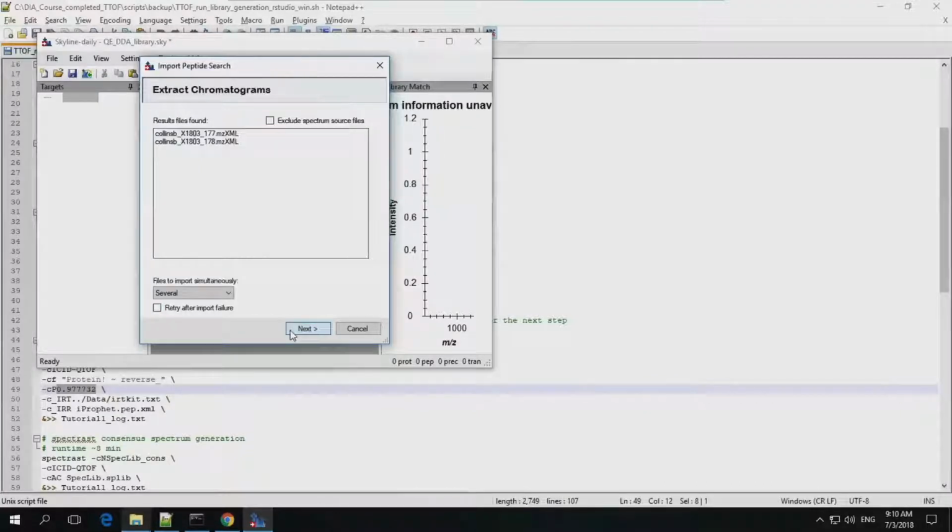So, and that helped me. I showed you that case with the rocket fins, where the rocket looks like it's taking off. I made some changes to how Skyline calculates IRTs from spectral libraries, and that helped get the rocket ship to look more like that second line that I had produced.